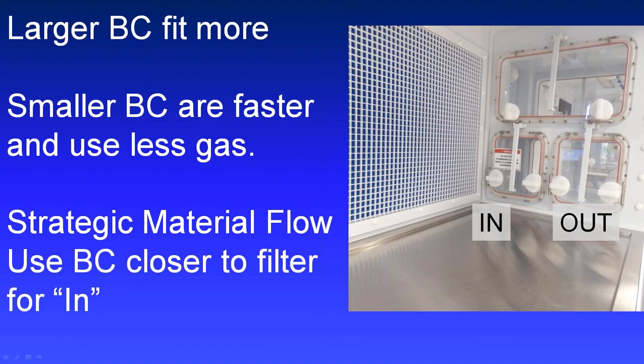Now, if you are using a dual buffer system like you see on the bottom of this stacked buffer module, it's a good idea to use the small buffer that's closest to the laminar flow hood filter as your indoor, because that is technically a cleaner space, being closer to that filter than the outdoor, which is closer to the room side of the LFH.